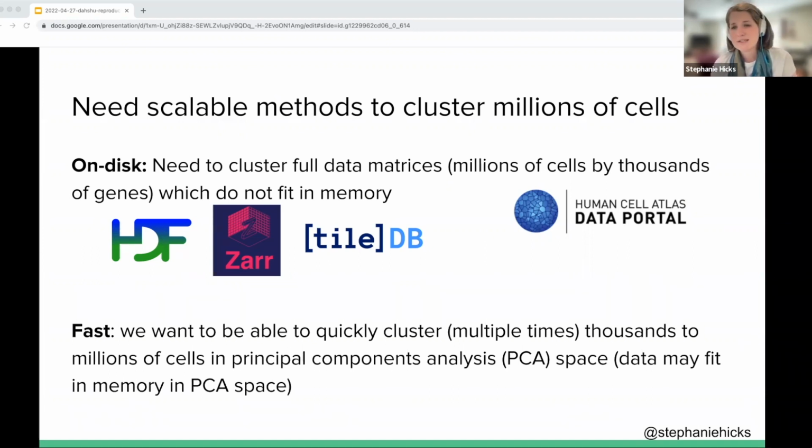Why would we want to do this? So I mentioned, for example, k-means. K-means is an algorithm that asks a user to provide a parameter, specifically K, or the number of groups that you want to partition your cells or observations in.